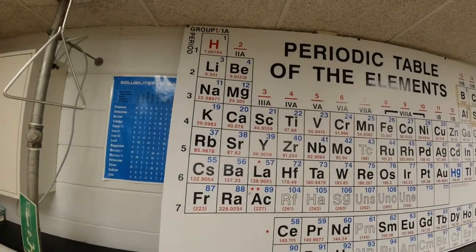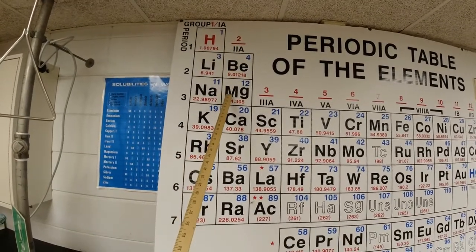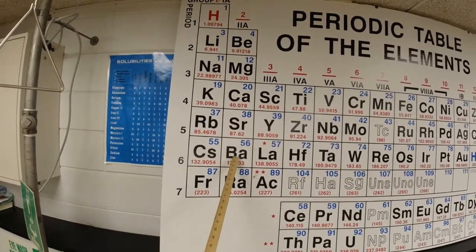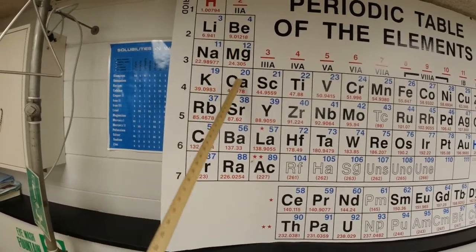We're going to do a lab today on the alkaline earth metals. The alkaline earth metals are a pretty reactive group. They're group 2, so let's look at the periodic table here. Group 2 is the second column right here. This has beryllium, magnesium, calcium, strontium, barium, and radium. We are going to focus on this part right here in the middle.